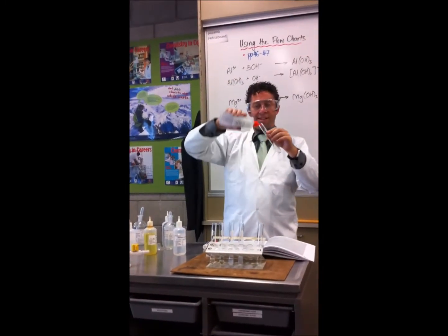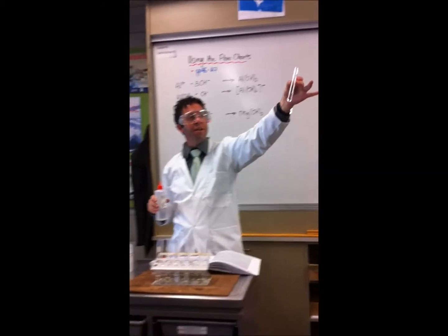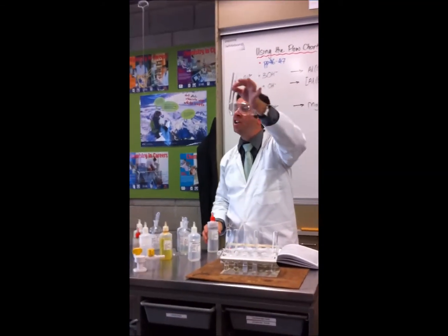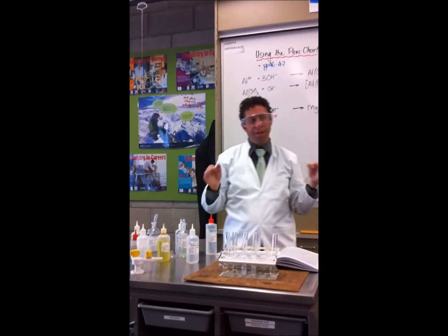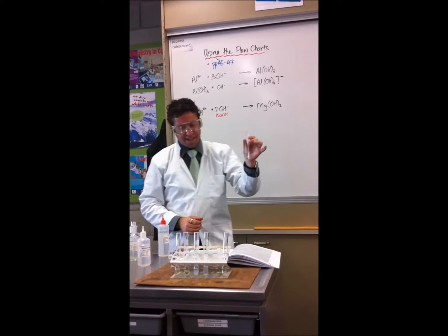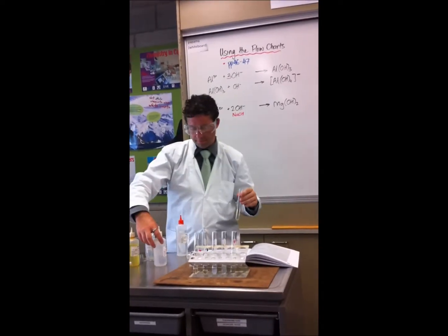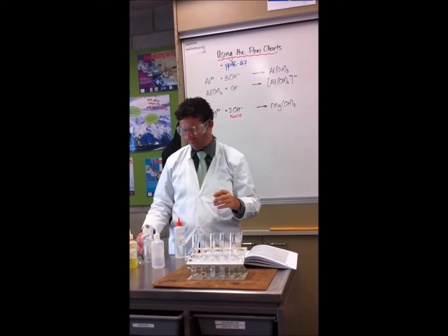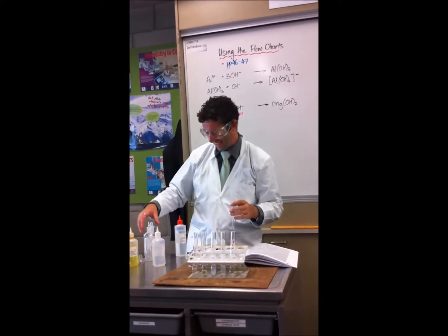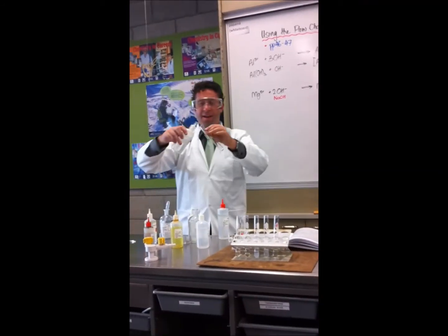Now if I go excess of this, that cloudiness disappeared. So now it can't be magnesium. It has to be aluminium, or lead, or zinc. Okay? It says in my thing to get a new sample, so I will. I should get the right one, otherwise I'll be really embarrassed. Put it. Oh, there it is. Sorry.